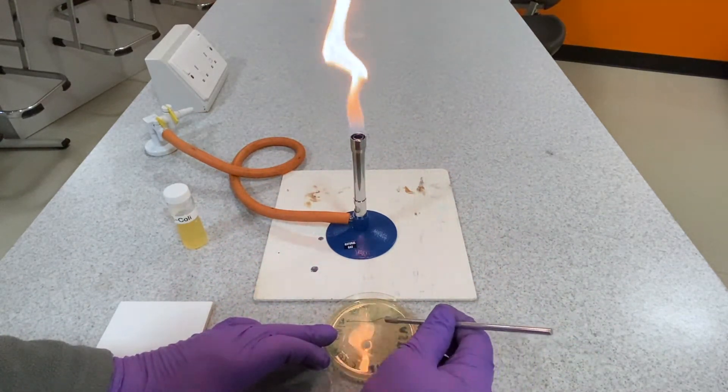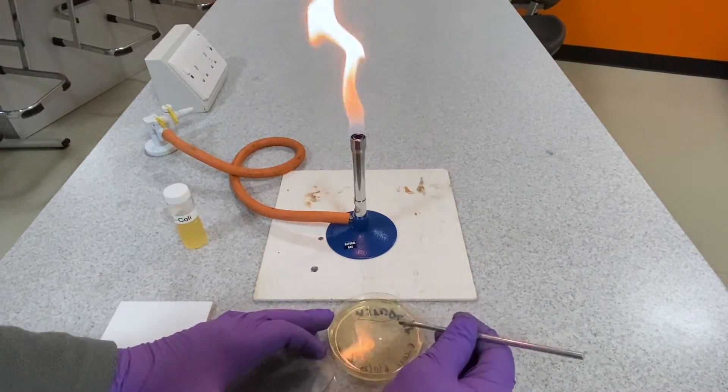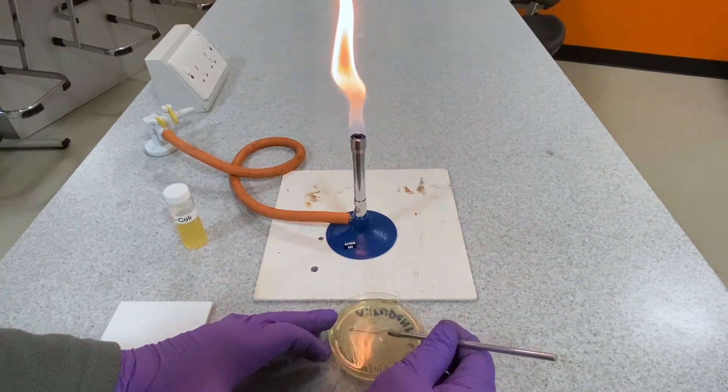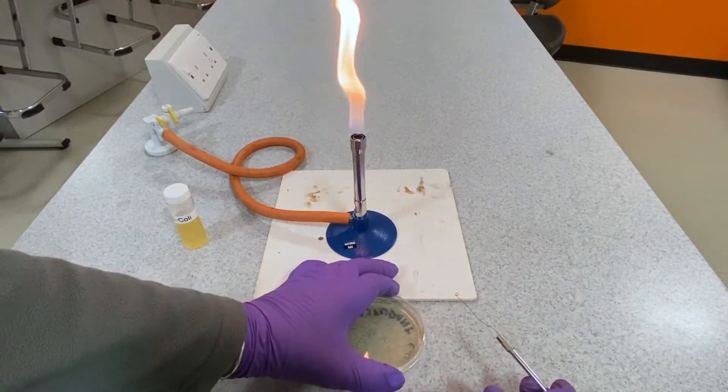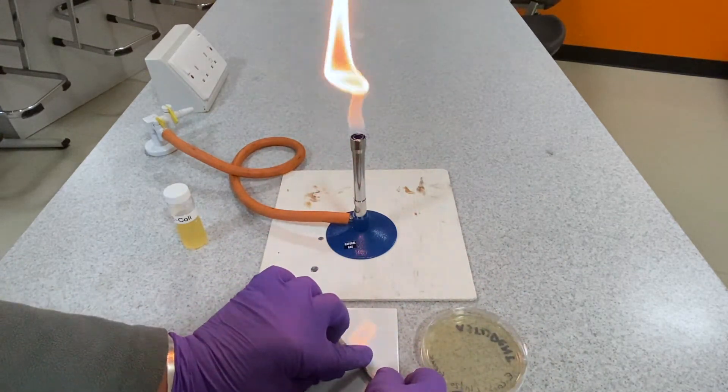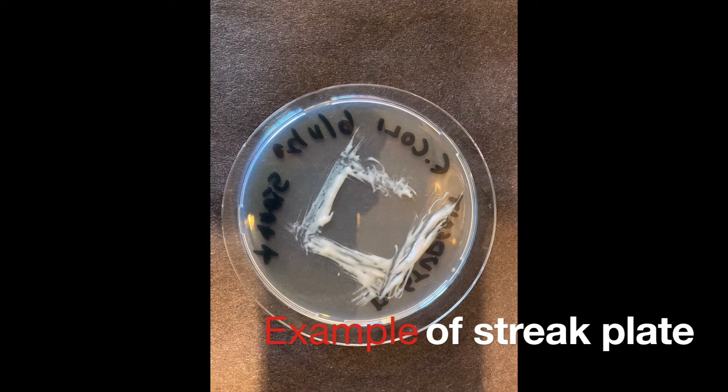The streaking is carried out in a prescribed manner: streak in the same direction whilst rotating the plate itself. Four directional streaks are carried out, each with a decreasing concentration of bacteria. The final streak direction will produce individual colonies of the bacteria.